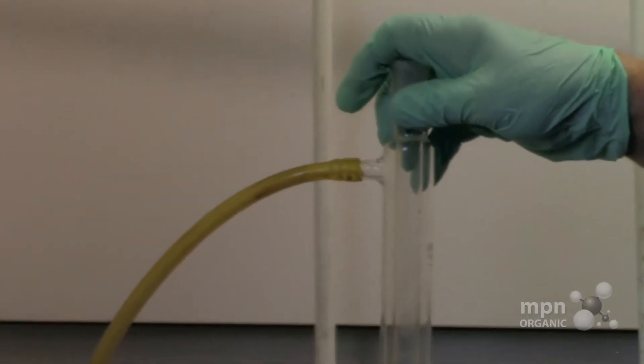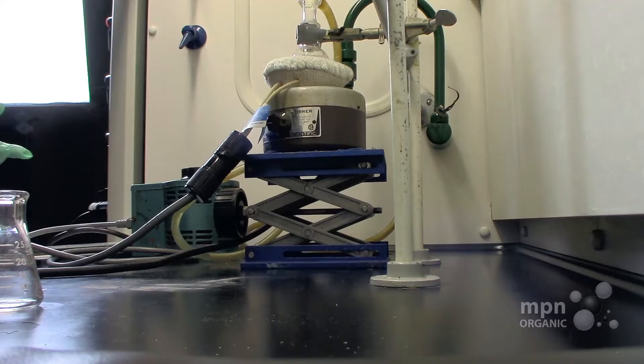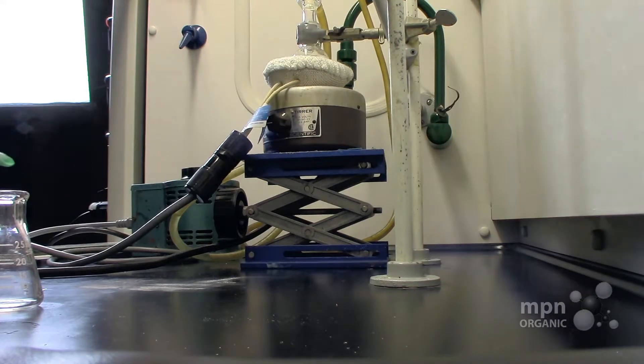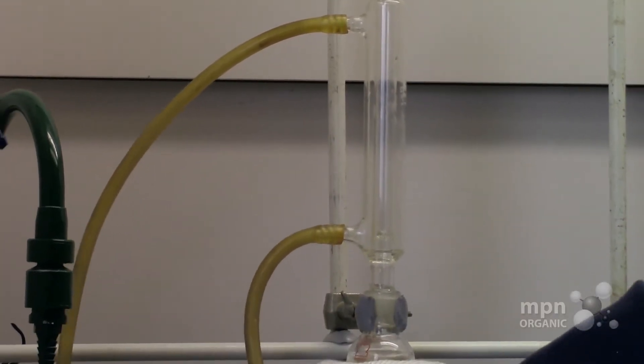Make sure the outlet hose and inlet hose are on there snugly enough, but not so snugly that you can't get them off afterwards. If you put them on too loosely, you may get a flood — and I know about floods, I'm an expert on it. So water is going to come in and water is going to go out.